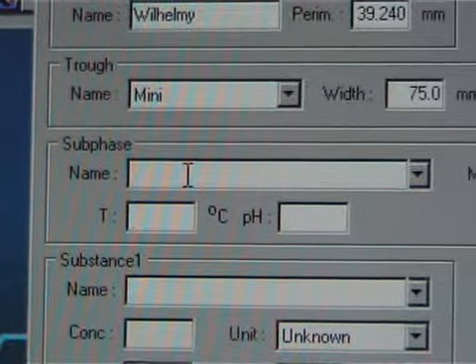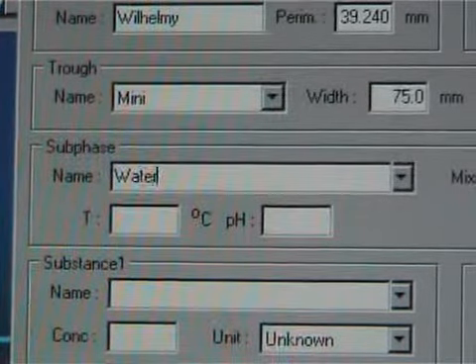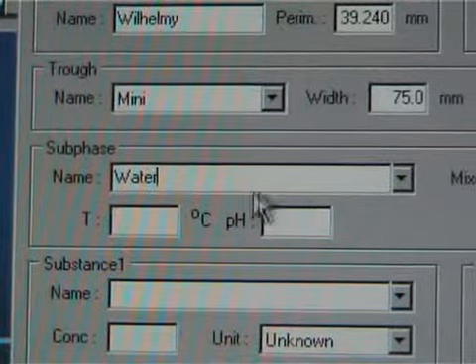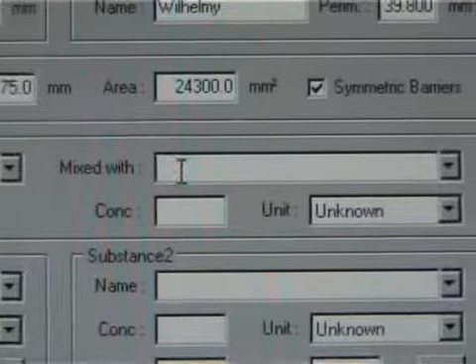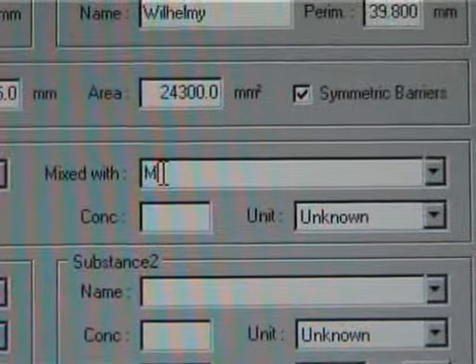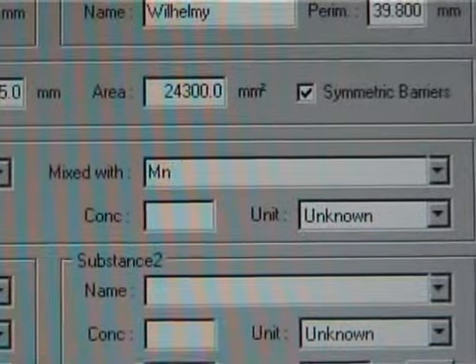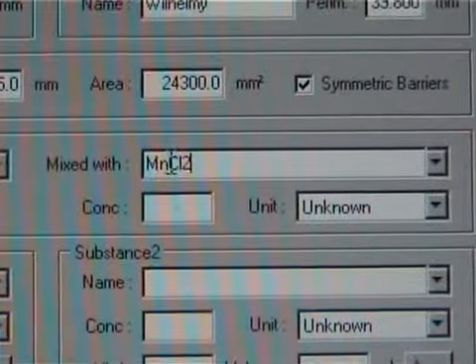Subphase is optional, but usually good to define. Also, if for example some salt is mixed in the subphase, the concentration can be typed into the experimental setup.